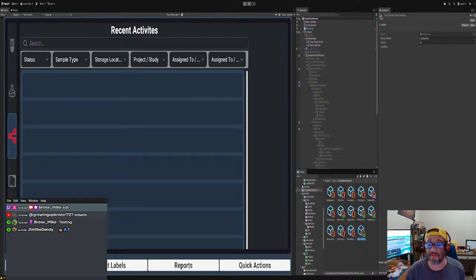So now the test service follows a pattern that we have. We're allowing them to be scriptable objects. So it's just easy for us to share between scenes. Now, if they're not pertaining to that scene, then they won't be loaded in that scene. That makes sense, which saves a lot of memory, right?